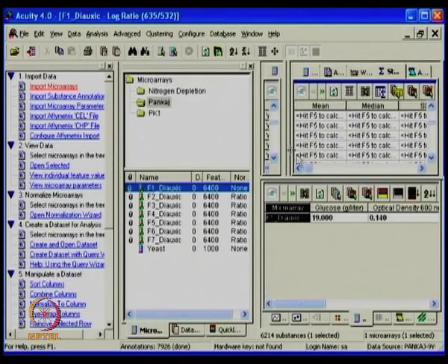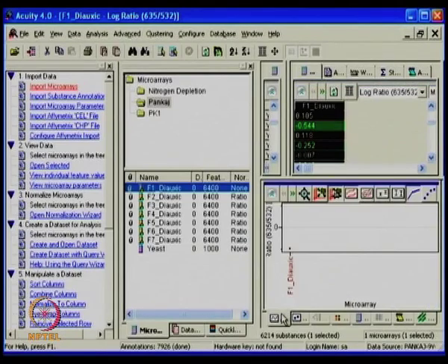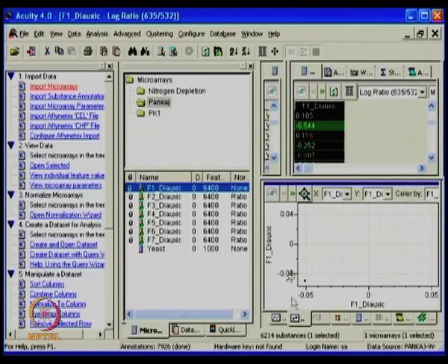Many a time what happens, let's say quickly for example, I want to go to one data and I would like to see how the first base is looking. So what I am going to do is look at each particular spot and look at the profile of it. Because it is only one, it is showing you one dot point. If I keep on including more and more arrays, the data dots start increasing, and immediately one can see the feature profiling, how it has performed.